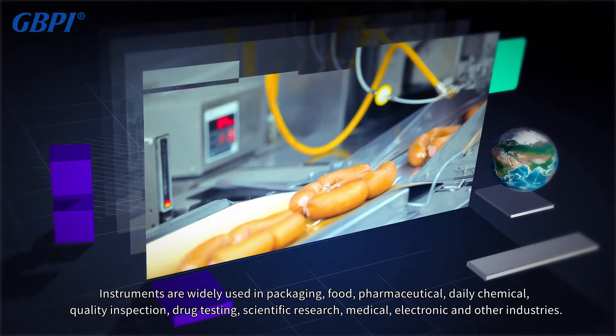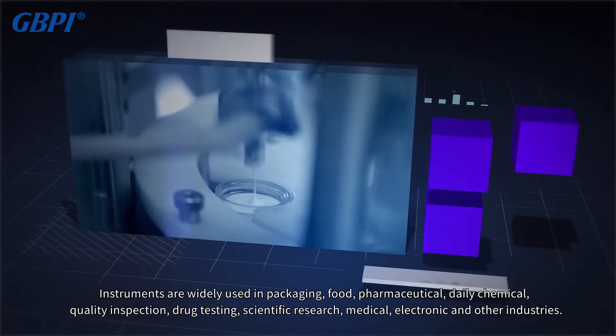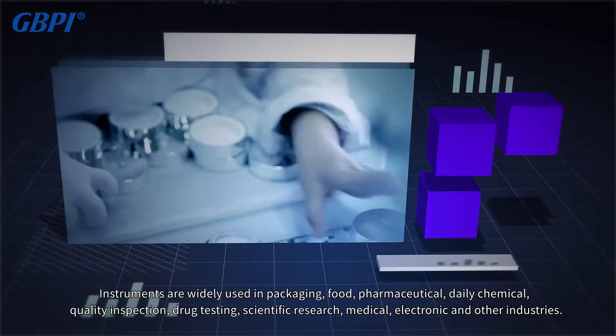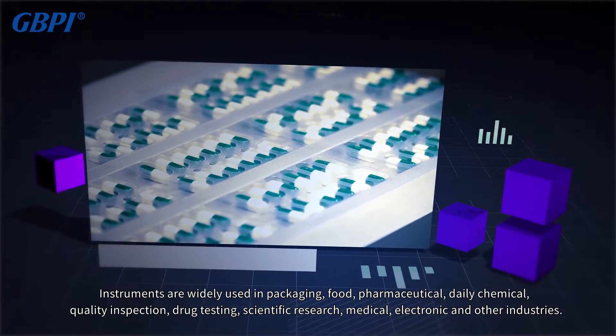The instruments are widely used in packaging, food, pharmaceutical, daily chemical, quality inspection, drug testing, scientific research, medical, electronic, and other industries.